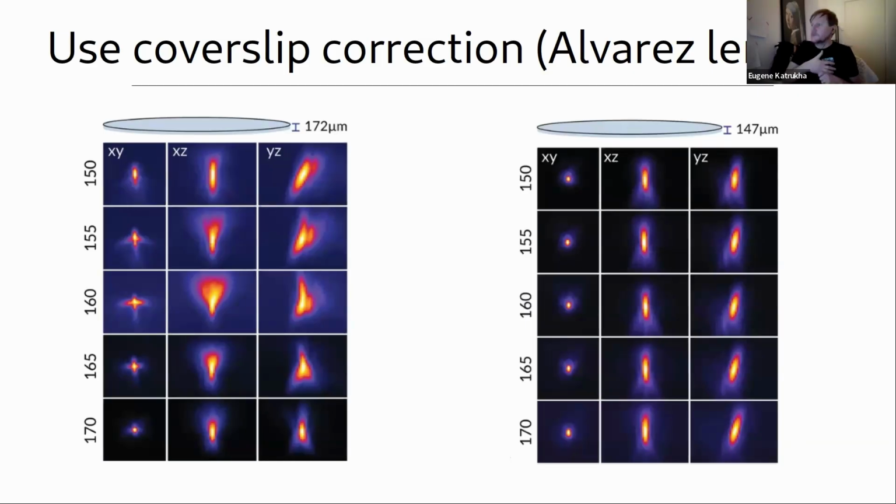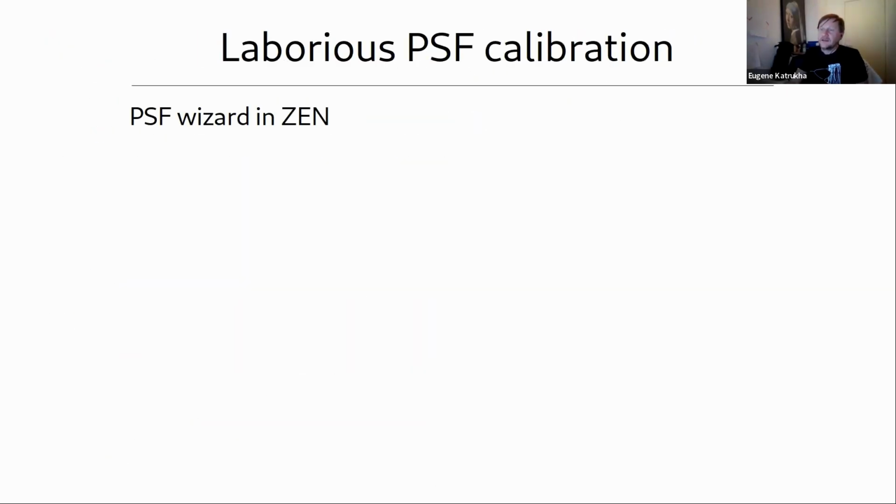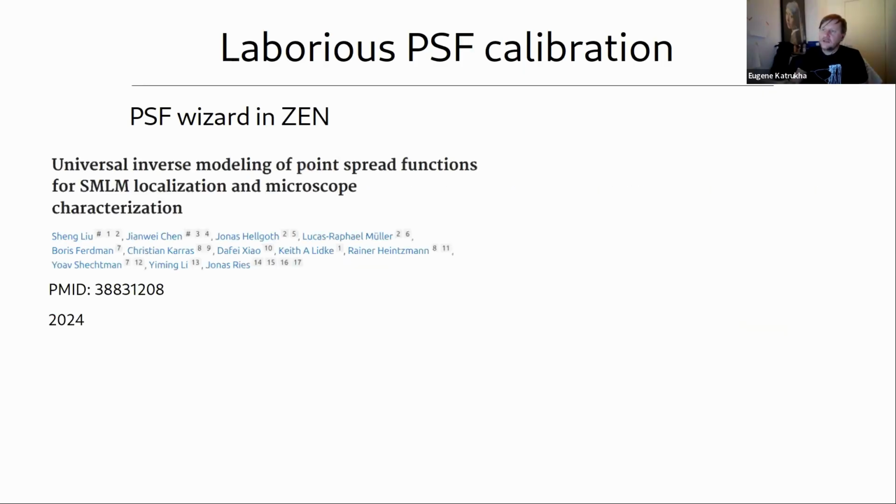At that point, Lucas, who is the head of the lab, was really disappointed. He said, "You need to send us this other machine, which was really bad. You don't want to have a good point spread function." But that was already a little bit later. And interestingly, there was a whole set of papers during the last couple of years which actually eliminated all the issues with astigmatism and point spread function and things like this.